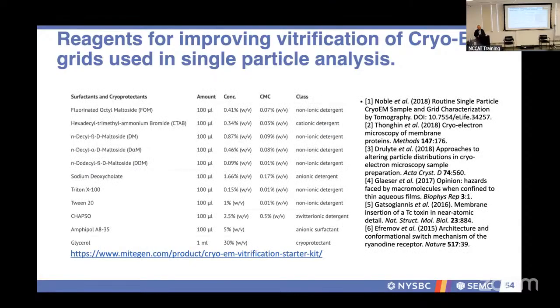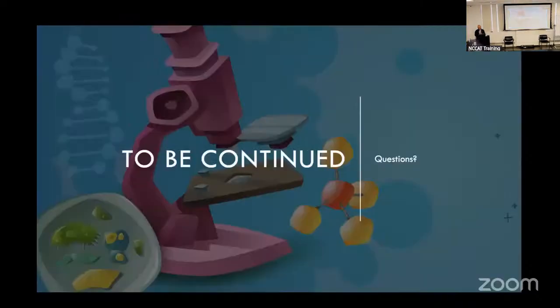And basically what they've done for you is a literature search. So if you're dealing with some of these fields or some of these targets, you can do a literature search and see, okay, commonly you can work around certain issues with particular additives or particular treatments. So we do have some of these kits. They are not universal. Very similar to X-ray crystallography, a lot of sample prep is trial and error.